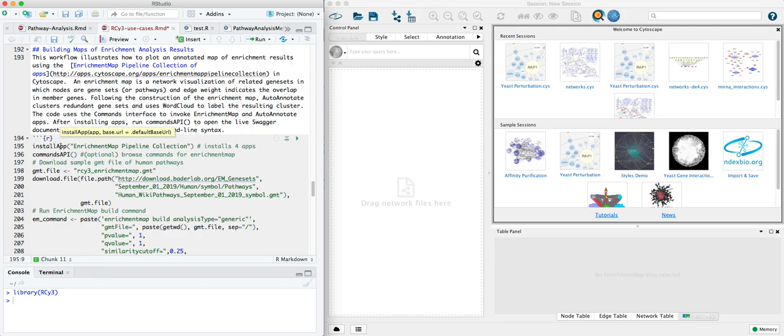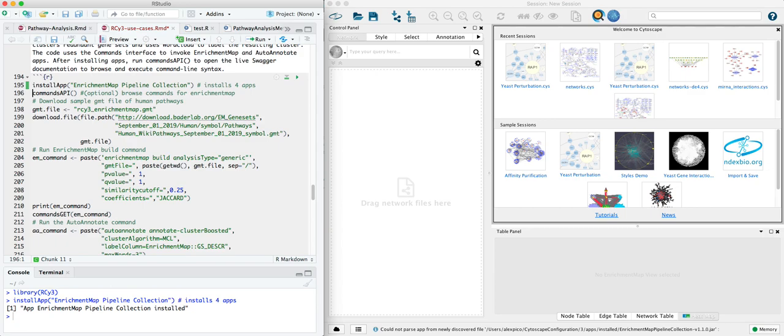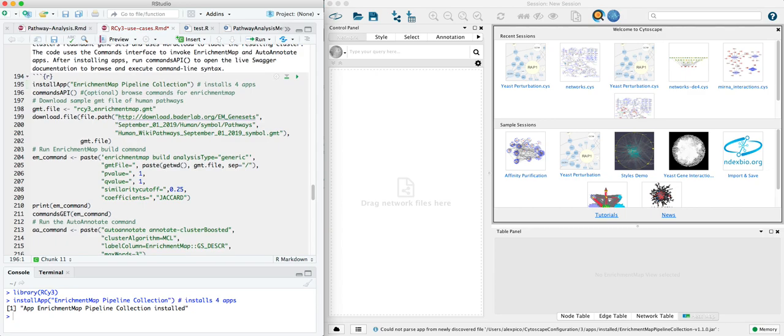In this case, we're going to install an app called the Enrichment Map Pipeline Collection, which is four apps all in one, including Enrichment Map, Auto Annotate, Word Cloud, and Cluster Maker 2. So we'll run that line to install those apps.